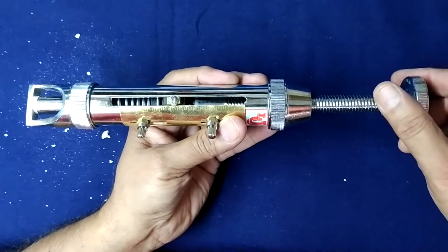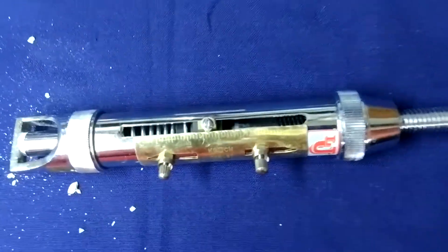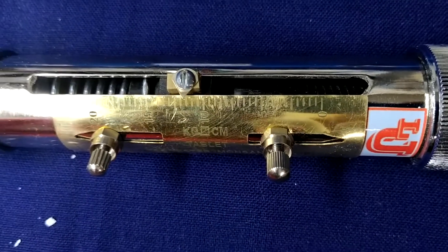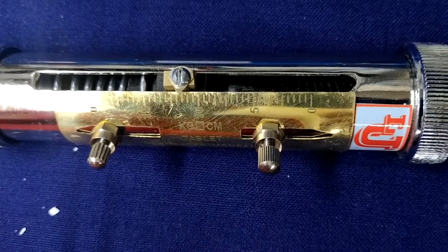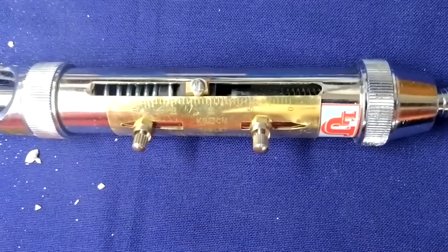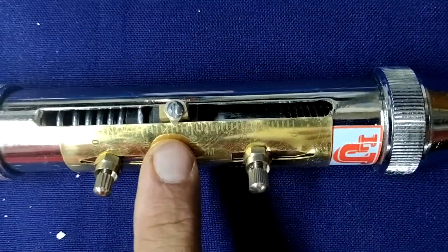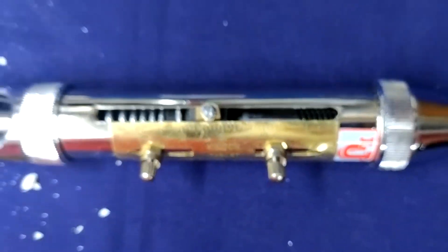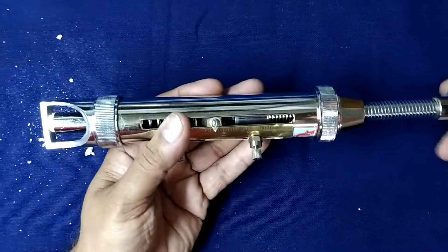Now the tablet crushes. Our scale division gives the result as 12 kg. The tablet crushes at 12 kg pressure. This is our final result — 10, 11, 12. Now loosen this.